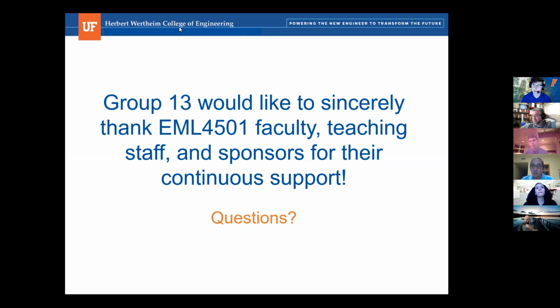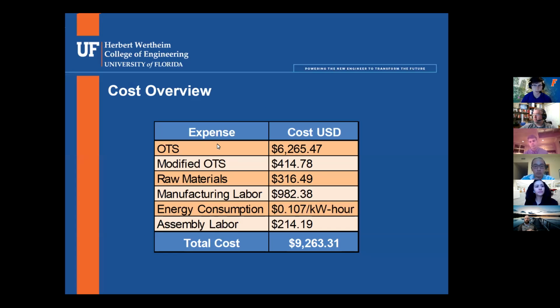I also don't believe we touched on this, but there are multiple temperature sensors located throughout the design. I believe there's one on the liquid handling subsystem, and another on the wall of the overall design, tucked in the corner. That will help us get temperature readings and then know what to do with the heating elements. Okay, that was one of my questions. I didn't see any of the sensors, so I was wondering how you were controlling with the feedback loop. Can you go back to an overall image of your entire design so we can see that while we're poking holes at it? Yeah, of course. I think it's at the beginning.